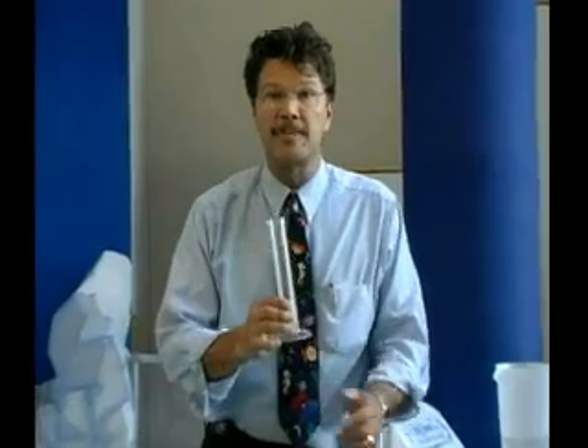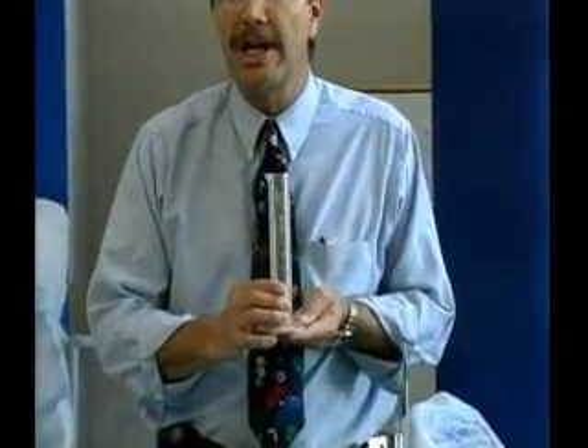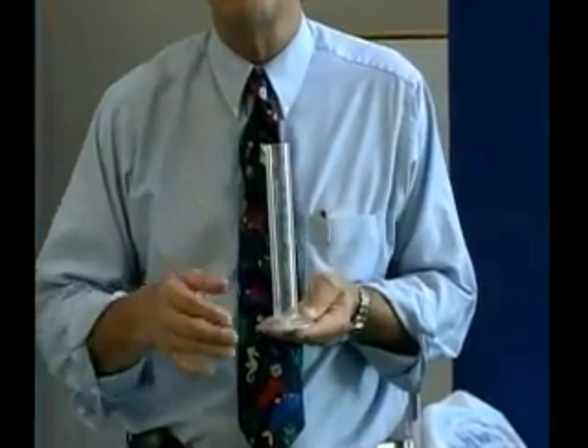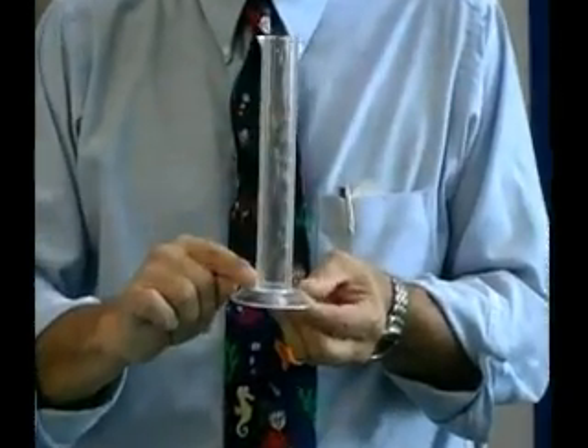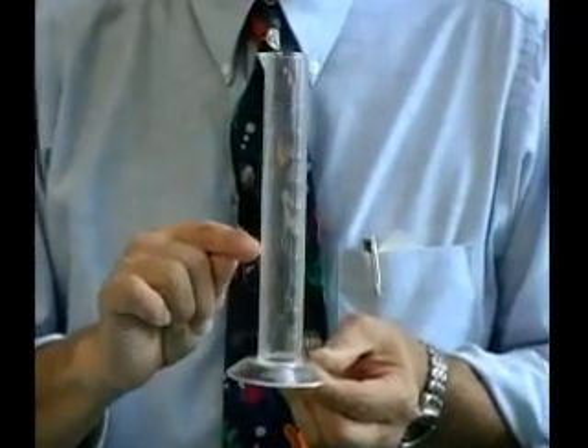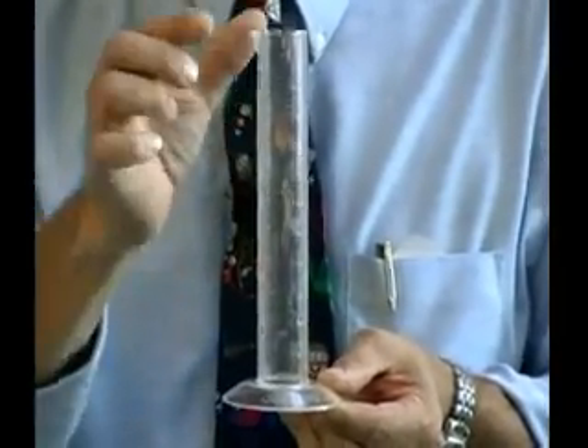The first tool that a scientist might use is called a graduated cylinder. A graduated cylinder is used to measure the volume of a liquid. It's interesting because it's graduated, or it has markings all the way up the side of the cylinder.